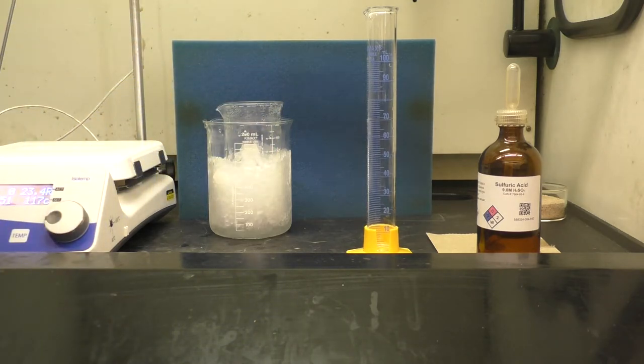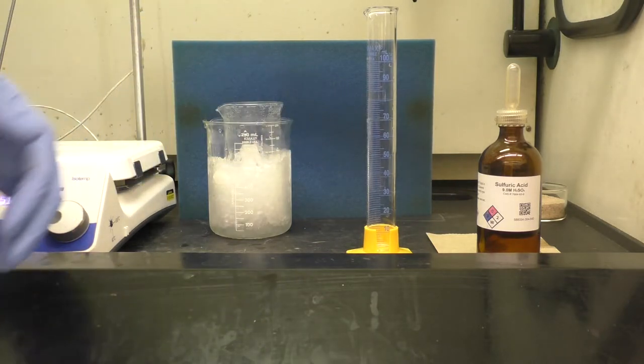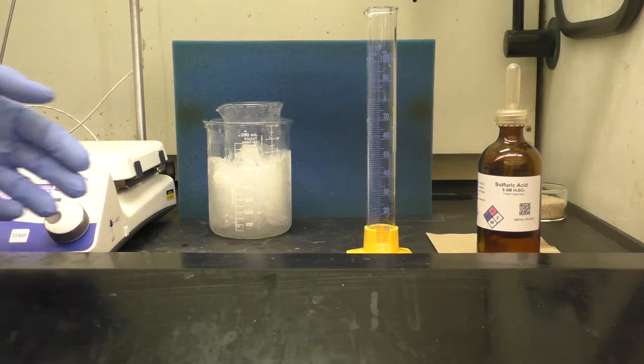So we should have protonated any carboxylate salt that would be left over from, or that would be the product from, the hydrolysis. And then we'll let that sit in an ice bath for quite a while to form crystalline material. We should see precipitate form when we add the sulfuric acid to the reaction mixture. So we'll begin by measuring out our 50 milliliters of 9 molar sulfuric acid.